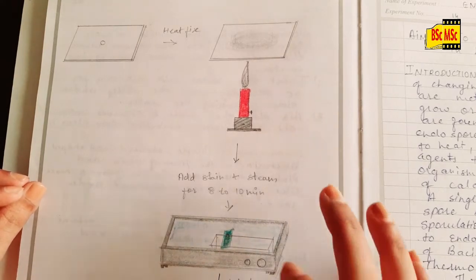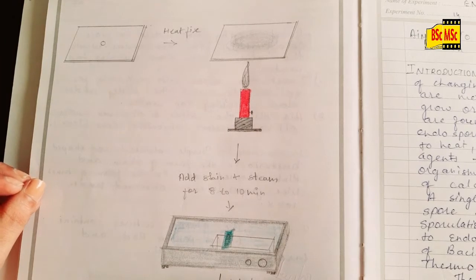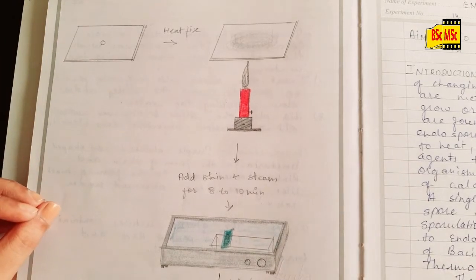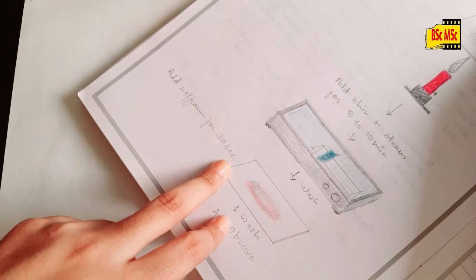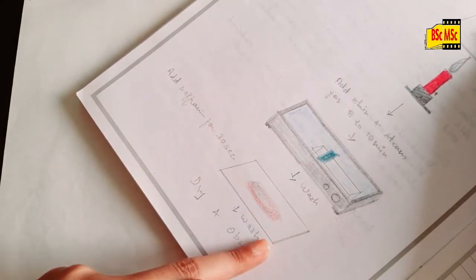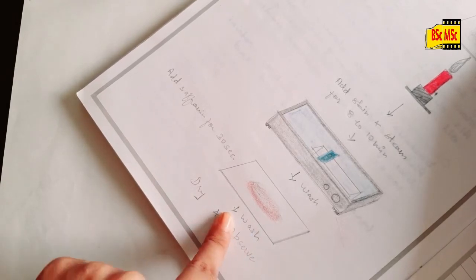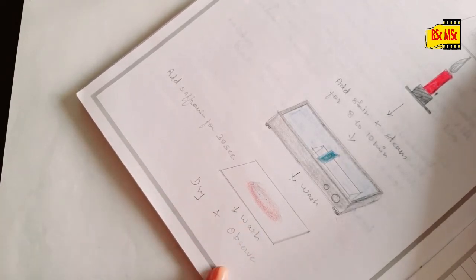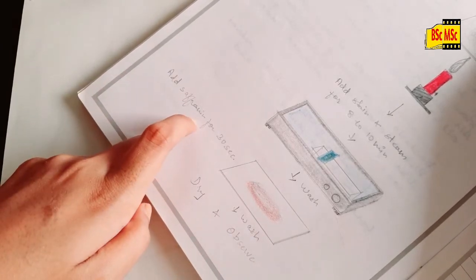Then wash the slide with distilled water drop by drop. After drying, add the safranin stain for 30 seconds. Then again wash off the excess stain with distilled water drop by drop, and let it dry or dry it with blotting paper, and then observe under the microscope. Why have we used the safranin stain here?